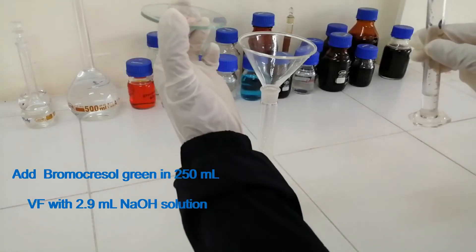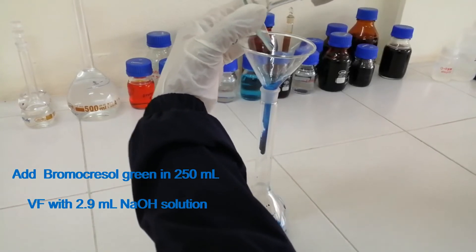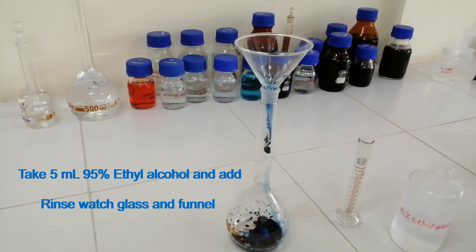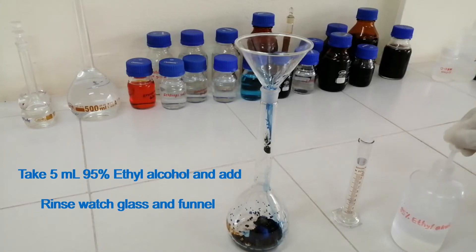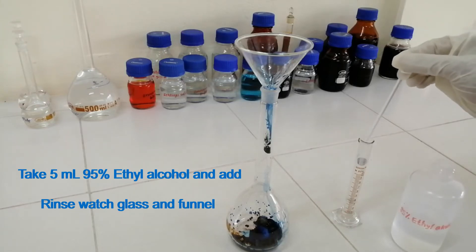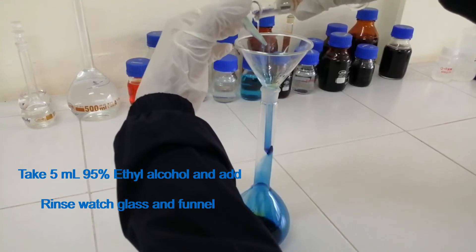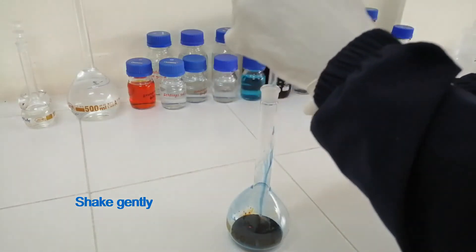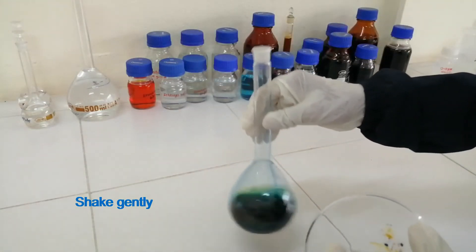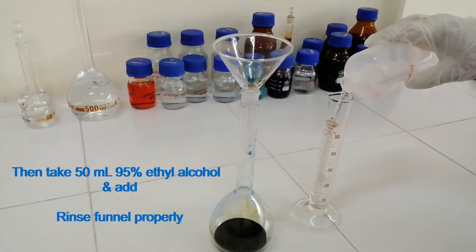Add the weighed amount of Bromocrysol Green into a 250 ml volumetric flask along with 2.9 ml sodium hydroxide solution. Then take 5 ml 95% Ethyl Alcohol and add, then take 50 ml 95% Ethyl Alcohol and add.